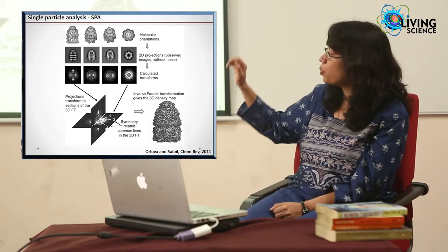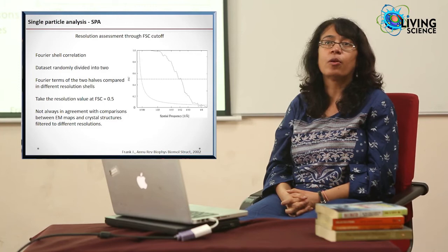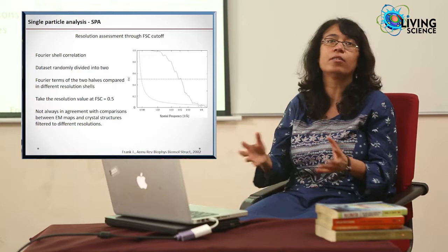Now, once one generates these 3D structures, the next question is, how would you figure out resolution? Resolution is a big question in structural biology, or the most important factor, because the better the resolution, the more detail of the biological macromolecule one can see.